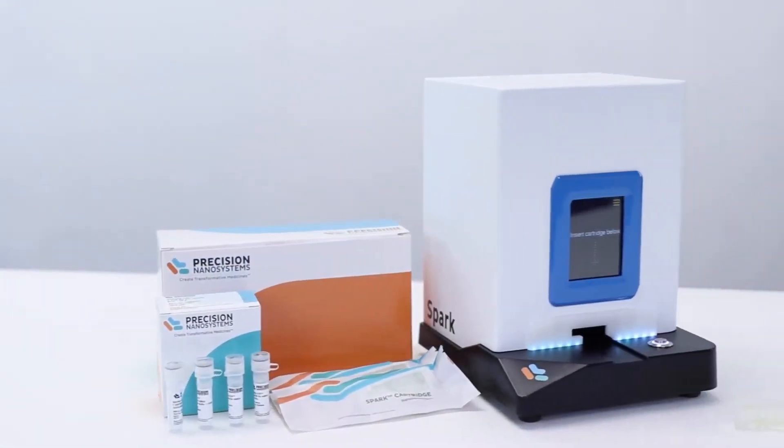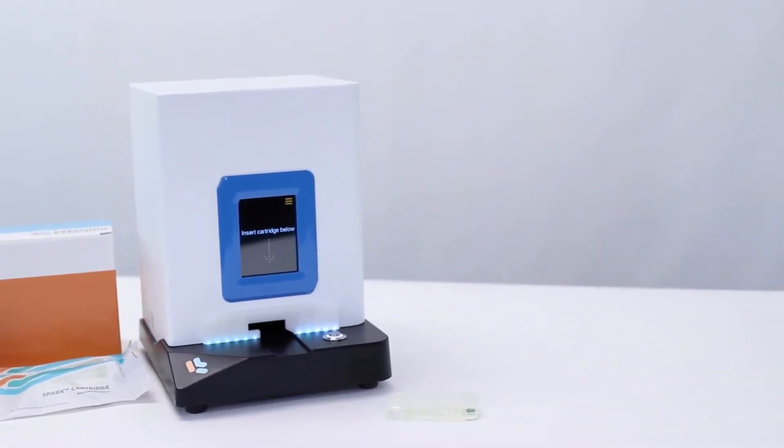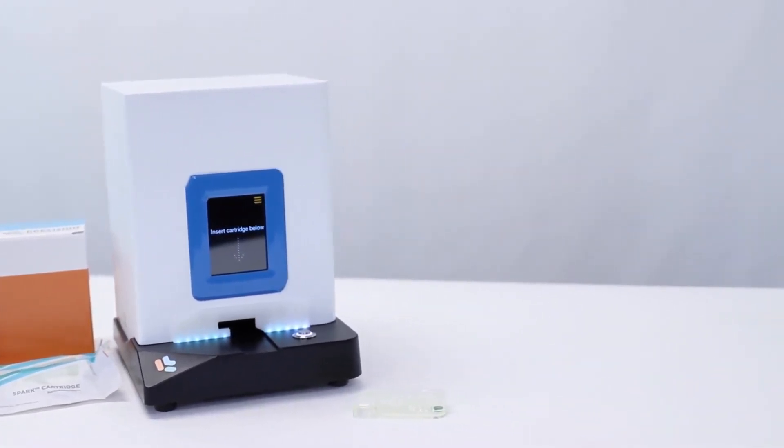In Kit Mode, inserting a cartridge associated with certain Spark kits will automatically select predetermined instrument settings appropriate for that kit.